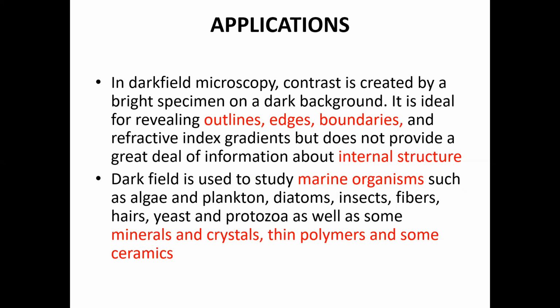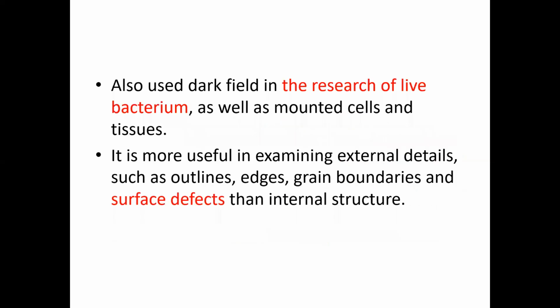The dark field can be used for studying marine organisms such as algae, planktons, diatoms, insect fibers, hair, yeast, protozoans, and also the structure of certain minerals, crystals, polymers, and ceramics. It is also used in research, and live bacteria can be studied. It is useful for examining the outline details, and not much information is provided about the internal structure.